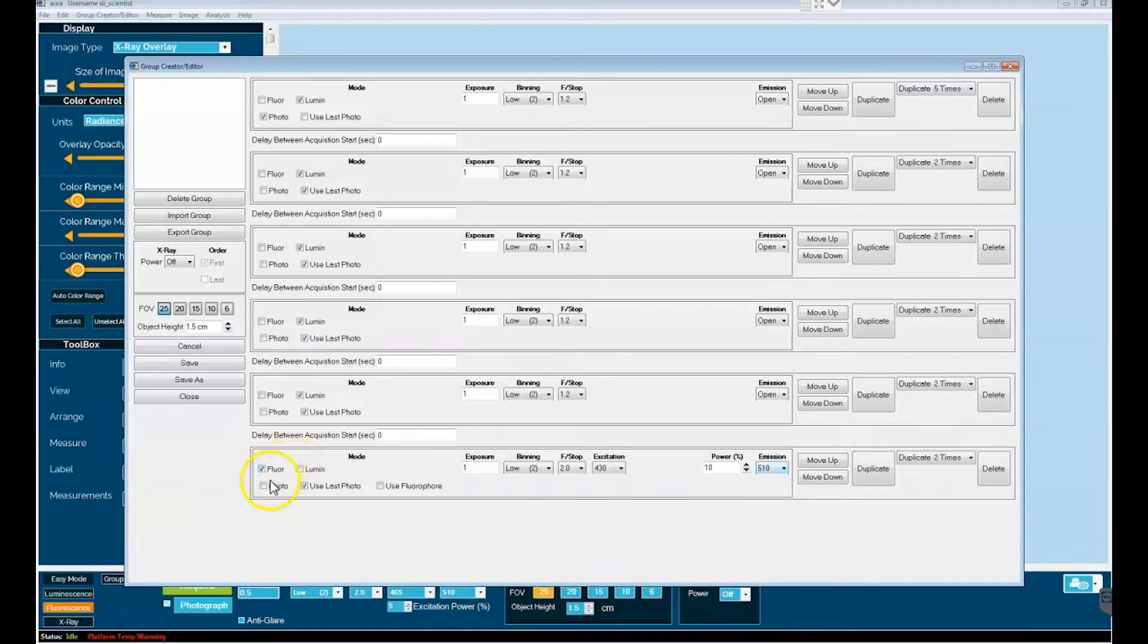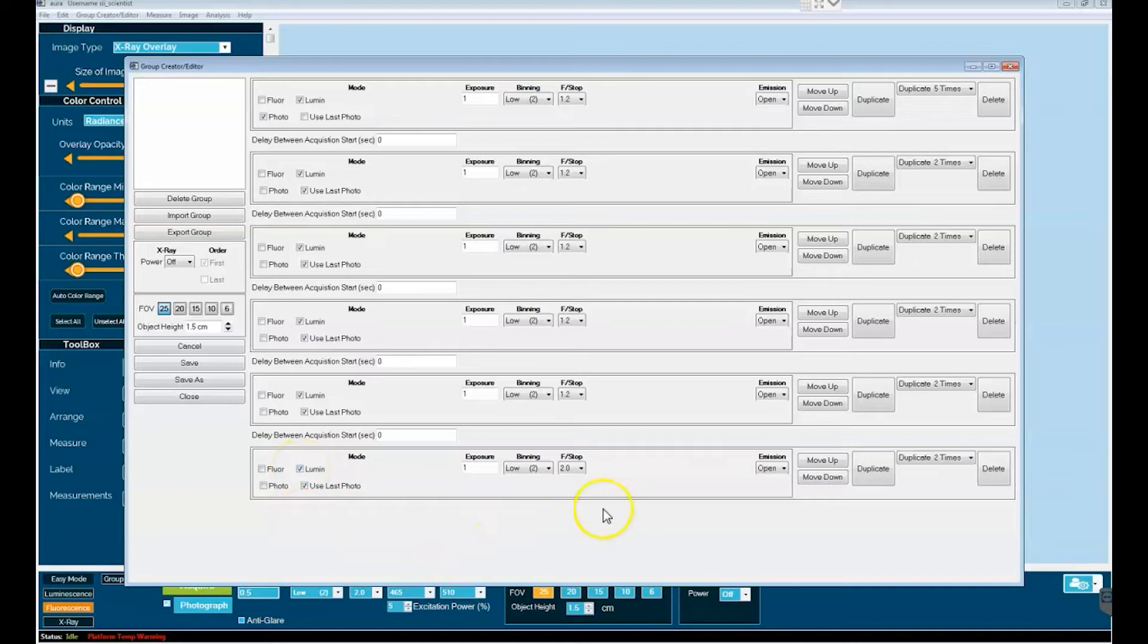Again, for our purposes here we will stay with luminescence and that simplifies it simply down to exposure, binning, f-stop and the selection of emission filter.